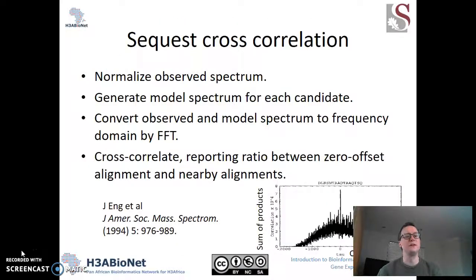Okay, so we've now decided on a set of peptides via the peptide mass filter that will be compared to the spectrum. But how do we do that comparison? In the Sequest algorithm, I'm giving a technical explanation in the slide, but I hope you'll just follow along with the simple one, basically. We have a projection of what the spectrum should look like if it were the sequence, and we have the observed spectrum itself. What we're going to do is rub one past the other at different offsets and ask how well they align at each of these offsets.